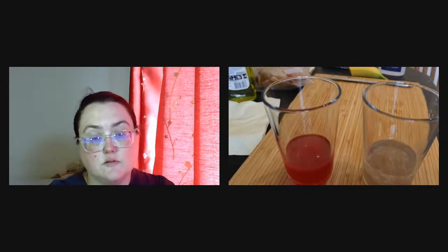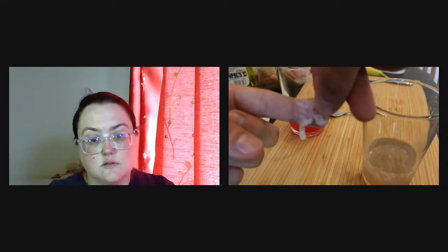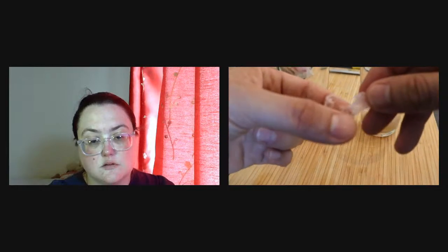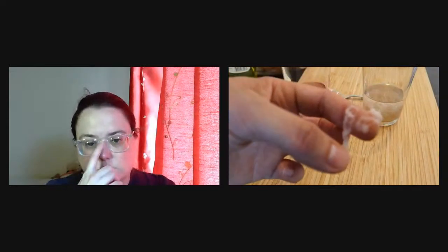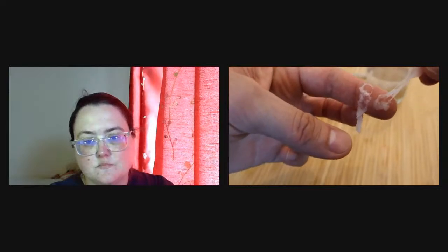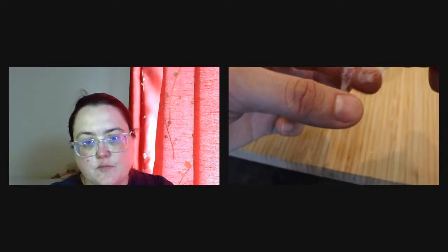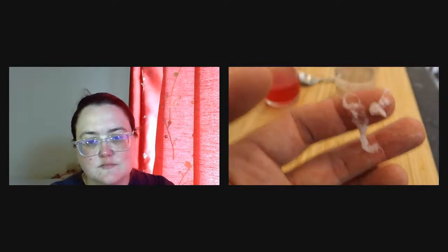And this is your DNA that you have extracted from your strawberry. You can see it's a very large amount. When I pull on it like that, you may be able to see, I probably need to focus on my fingers. Here we go. It's kind of stringy. You can see strings forming when I pull on this. This is actually thousands of DNA molecules in there, quite a lot.